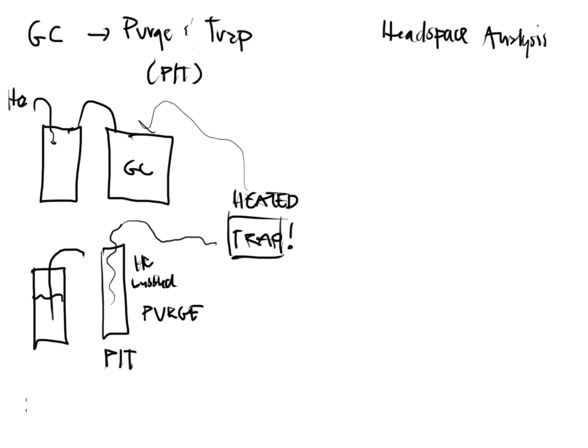Now go back and take another glance at the TOC notes that you've taken. The TOC measured non-purgeable organic compounds. So it took a sample, it purged it, but it purged it with air, not helium. It got rid of the volatiles, and out they went. And what was left over was the non-purgeables, and this is what TOC analyzed.